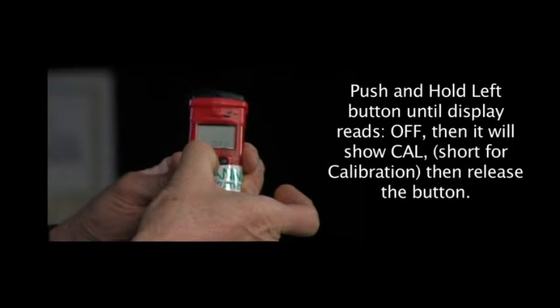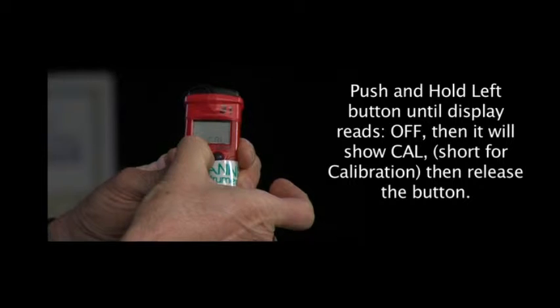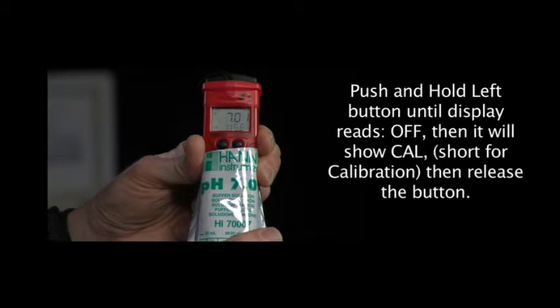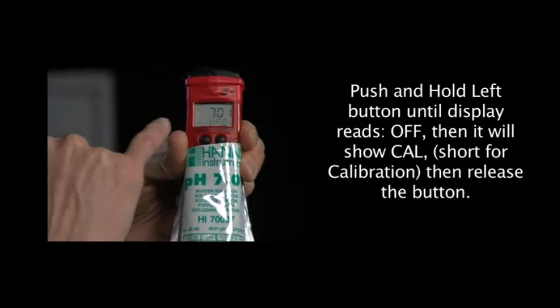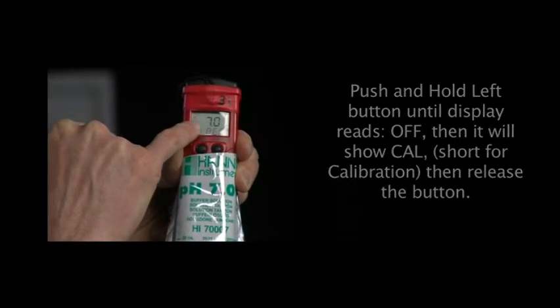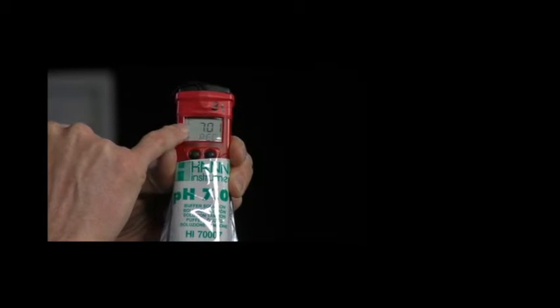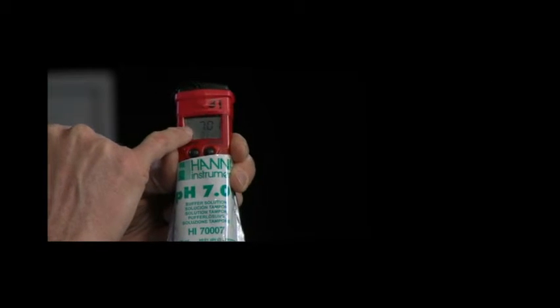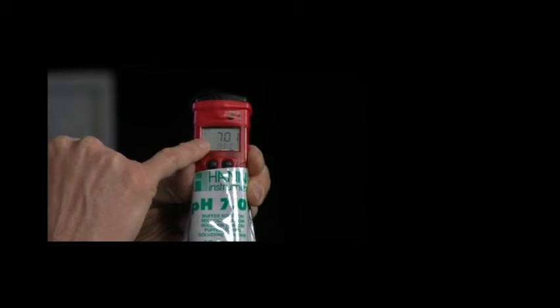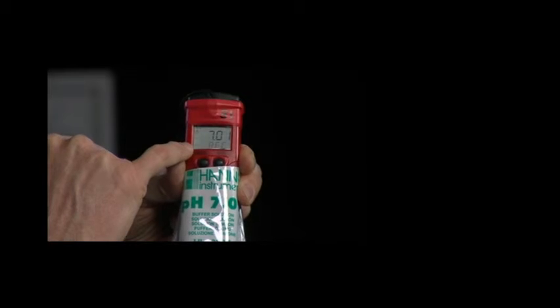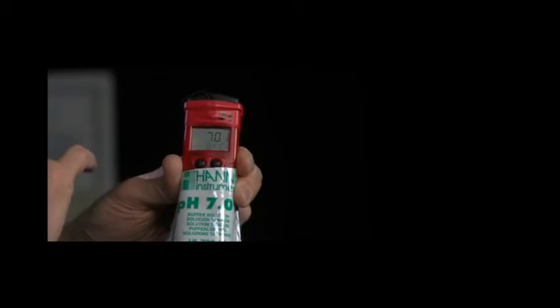We're going to hold it. It says off. And then it says CAL. I'll take my finger off. We'll wait for a minute. We'll keep an eye on this number up here. It says 7. We're going to wait until that switches to a 4.